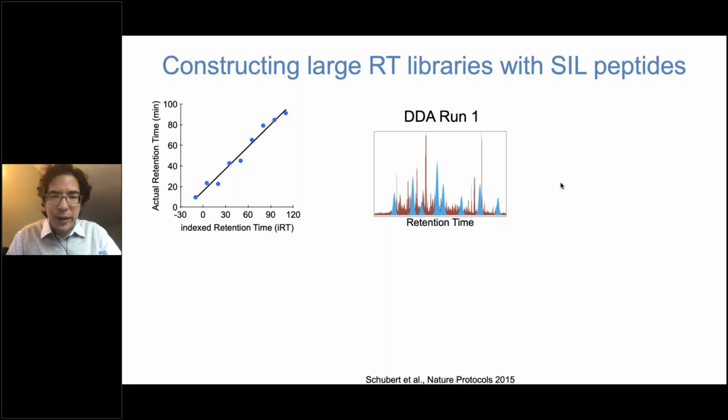So for example, the Pierce retention time standard is a really good, inexpensive standard that I highly recommend. But you could buy peptides of your own. You could use BSA, digested BSA. You could even use peptides that are endogenous in your sample as retention time anchors, as long as you or someone else has been able to map them onto a single line.